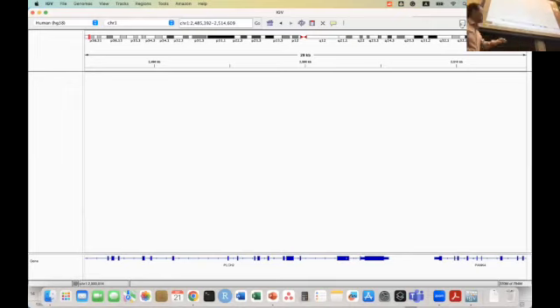Let me just show you one tip that I'm using. This is in the bottom, right? And the position is up. So it's not really convenient. So can you carefully bring your mouse to this borderline? When you bring that to the borderline, does it change the icon to an up and down arrow?